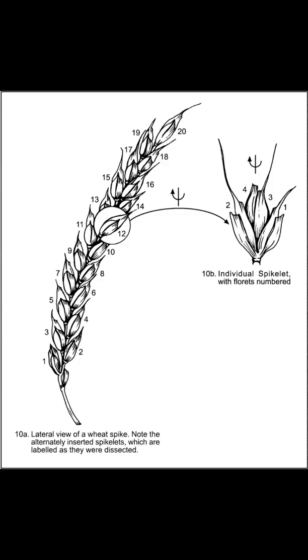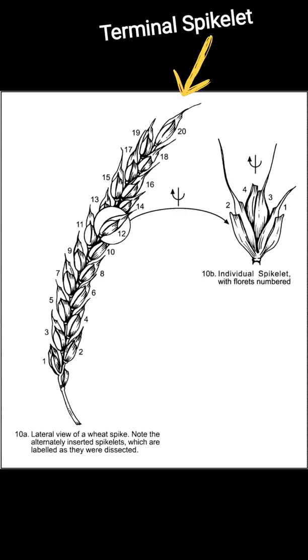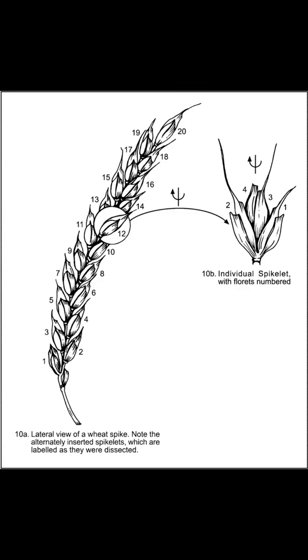Now, in spikelets, it's a determinate number, meaning that once the terminal spikelet has formed at the very top, no more spikelets are going to form on the spike. And for my expression work, I want to check the expression of my gene before the terminal spikelet has been developed. So let's take a look at some of the meristems.